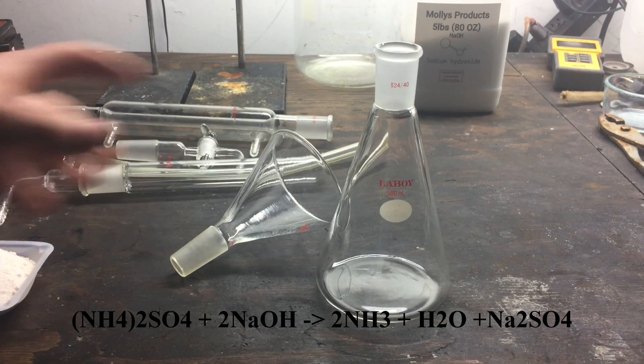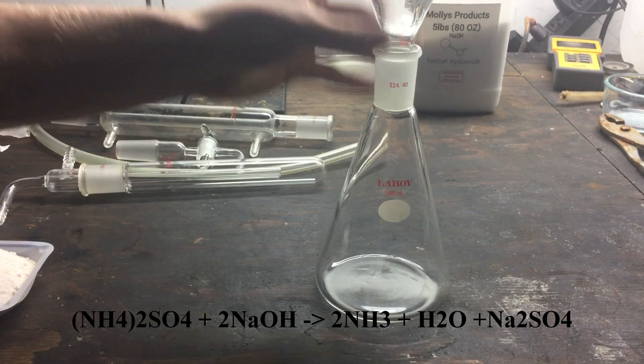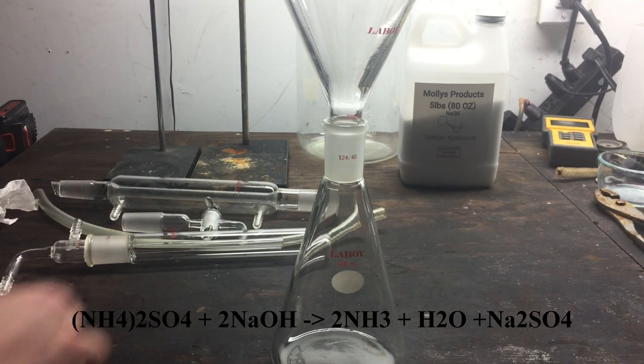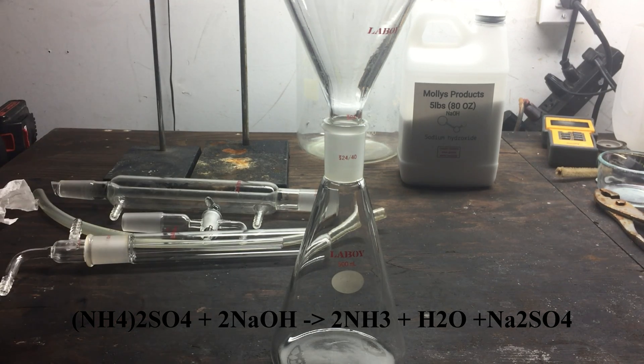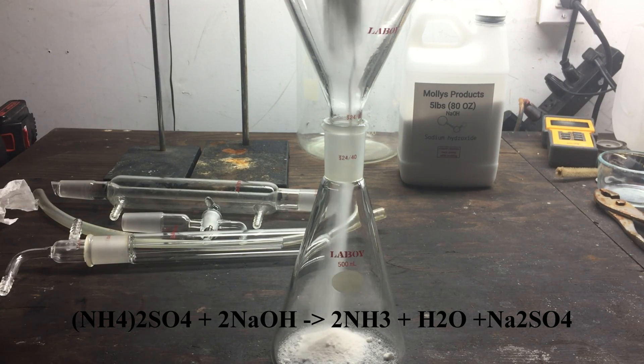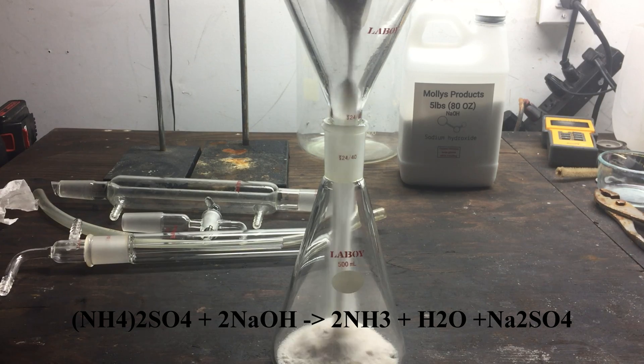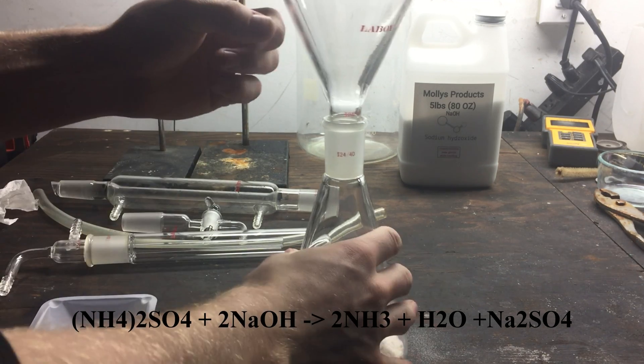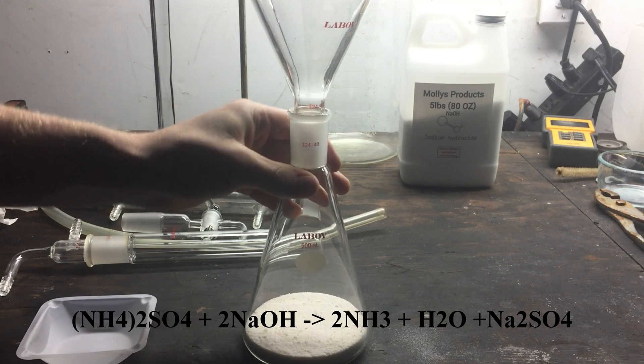After weighing, I added the ammonium sulfate to the beaker and determined stoichiometrically that I would need about 56.4 grams of sodium hydroxide based on the following equation. The products of the reaction are ammonia gas, water, and sodium sulfate.